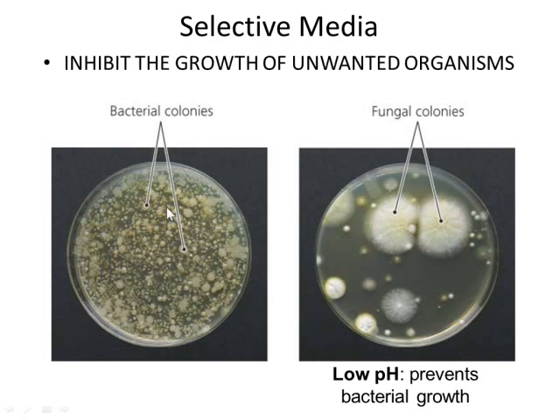Now this leads then into selective media, but let's just define what selective media does. It inhibits the growth of unwanted organisms while supporting the growth of wanted organisms.